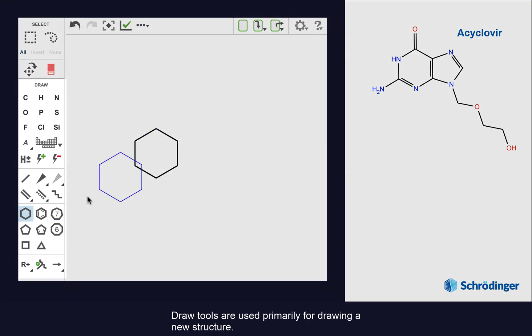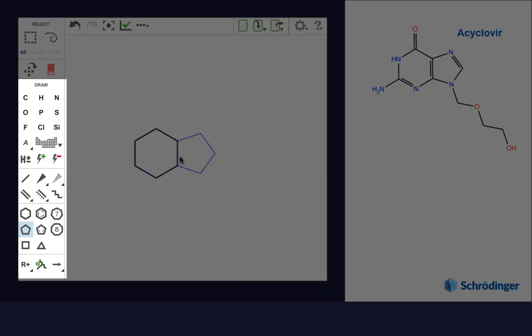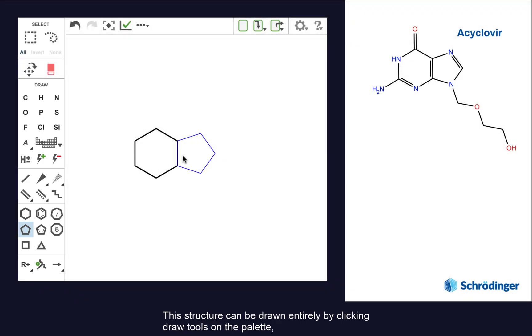Draw tools are used primarily for drawing a new structure. We're going to demonstrate this by drawing acyclovir. This structure can be drawn entirely by clicking draw tools on the palette, or more efficiently, by once again using keyboard shortcuts.